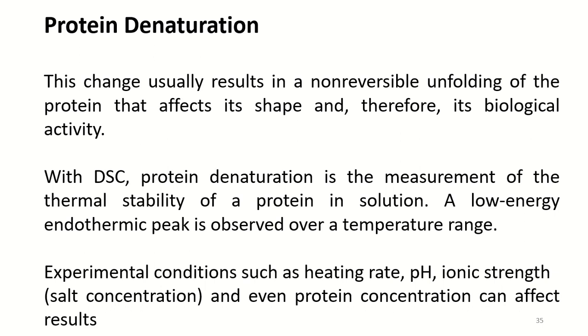The temperature of the peak provides us some information about thermal stability, and the area of the peak is a quantitative measure of energy absorbed by the protein in order to change the structure. Experimental conditions such as heating rate, pH, ionic strength, and even protein concentration can affect results.